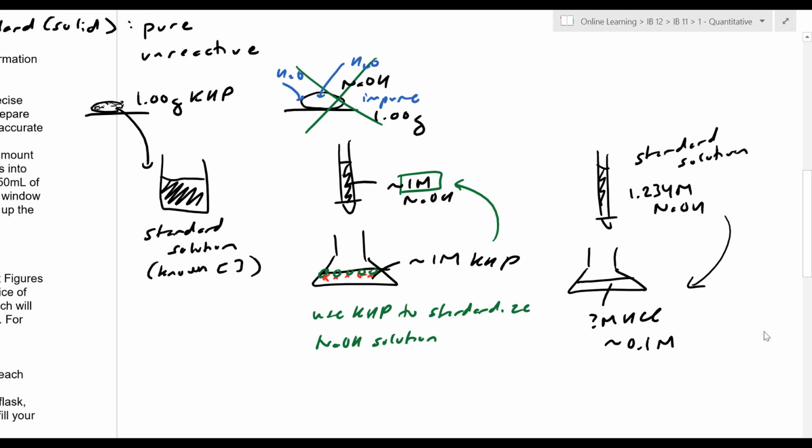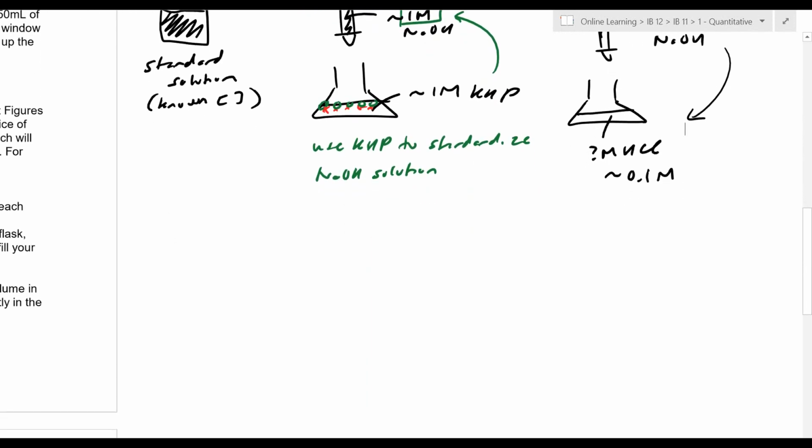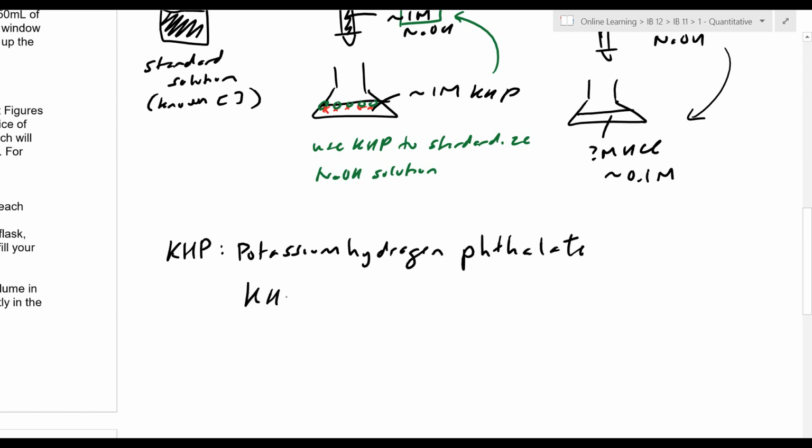Okay, so here we are back on our OneNote here. I'm just going to show you some of the calculations that we did, and then as well use some of that titration data. At first, I do want to show you what this KHP stands for. KHP here is known as our acidic primary standard. KHP is actually a chemical here, potassium hydrogen phthalate. So a very fancy name here. The formula is KHC8H4O4. And what we care about is the molar mass, which is actually 204.22.